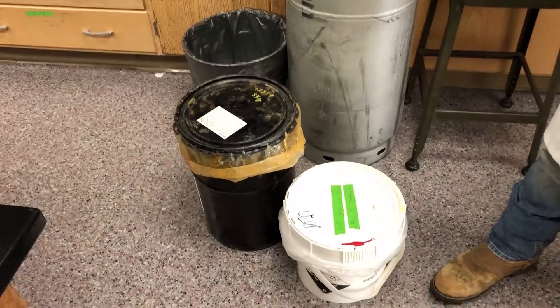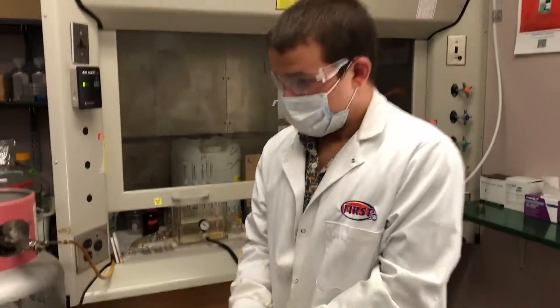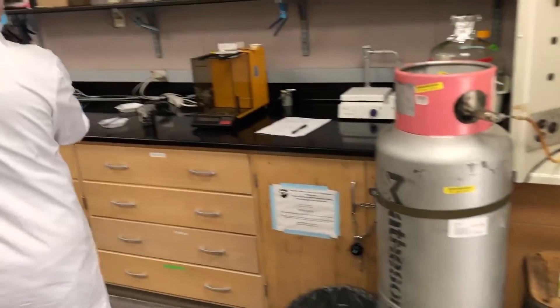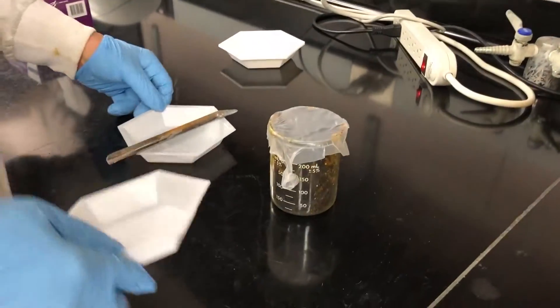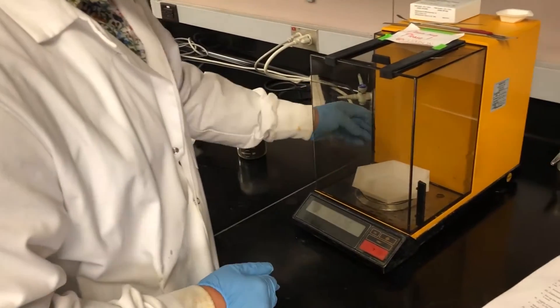We have ferric chloride and sodium hydroxide in these two buckets. Dawson's putting on his gloves to take some samples. He already has some ferric chloride in this beaker, and we'll use the weigh boat and get it measured out.